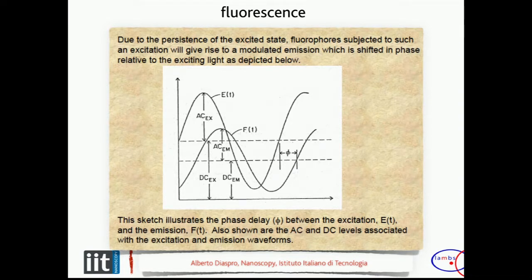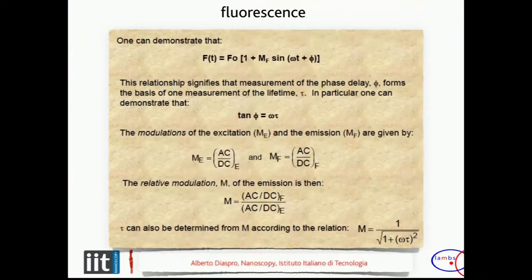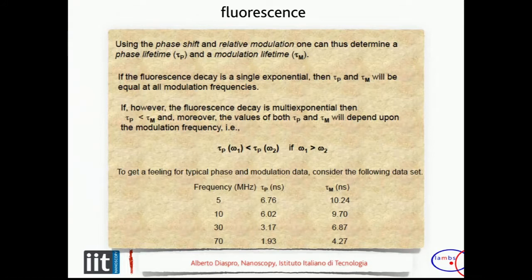And since it's modulated, the signal-to-noise ratio is better. Then you will have this slide, and we can demonstrate the relationship between phase and lifetime. So these are the two main ways that you have for measuring lifetime.